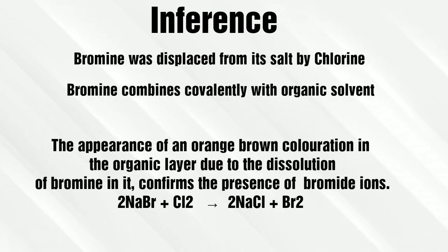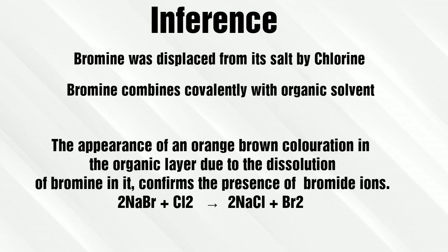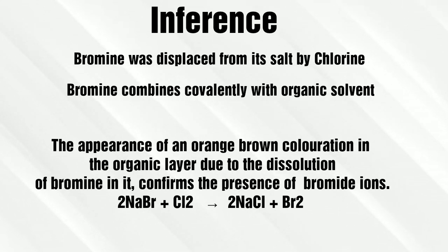The chlorine reacted with sodium bromide to produce bromine gas, and this bromine gas combined covalently with the chloroform, producing the yellow to orange color in the organic layer.